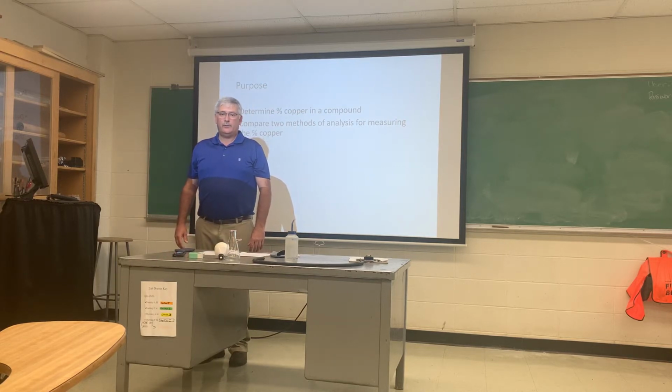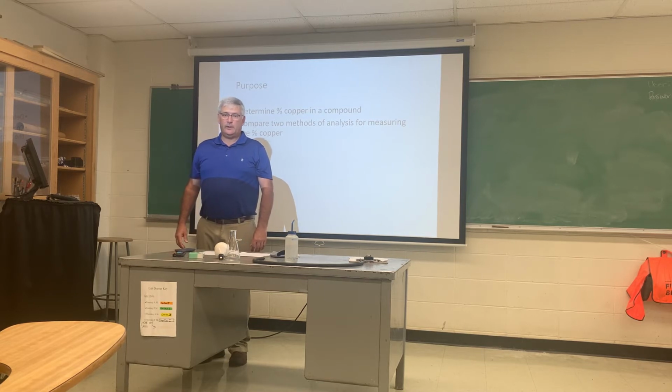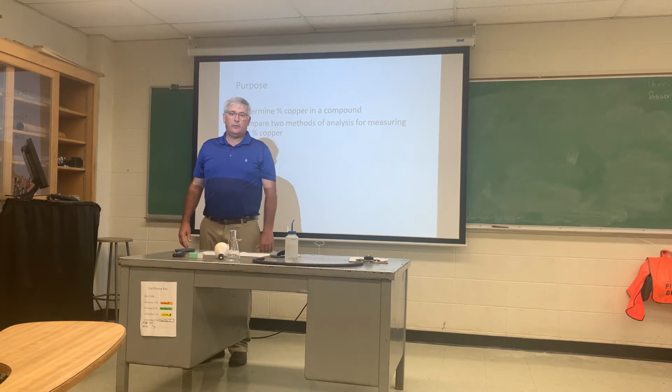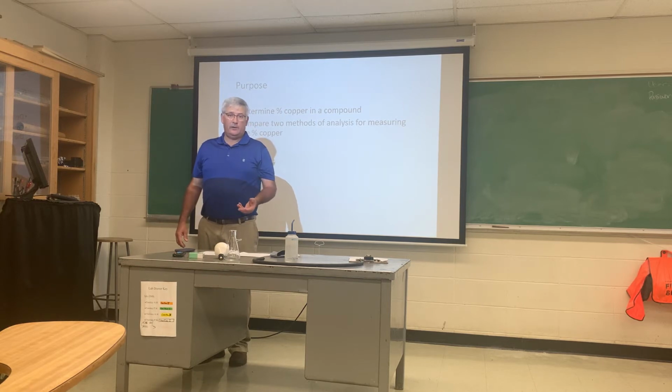Welcome to General Chemistry Laboratory with Dr. Garrison. This week we're going to be analyzing a copper compound to determine the percent copper. We're going to use two analytical techniques and compare those.